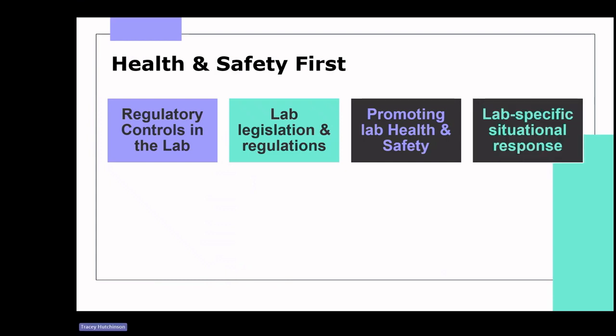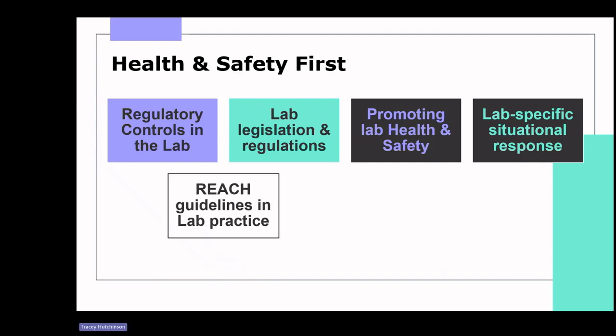Dealing with situations in a lab context requires following relevant SOP. Whether it's a spillage or an equipment fault, swift responses, securement of areas and thorough reporting are imperative. Within the lab, understanding and implementing REACH guidelines are paramount. These guidelines ensure the safe use of chemicals, promoting alternative assessment methods, and prioritising human health and environmental protection.